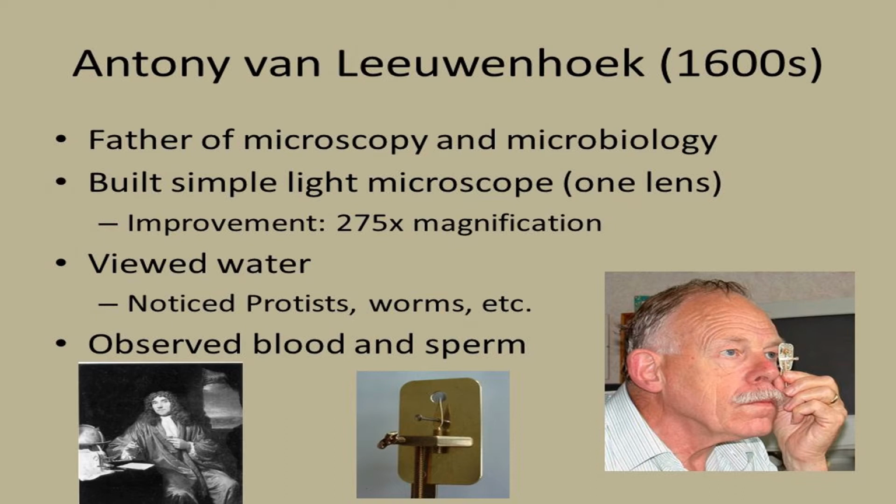He built simple light microscope, meaning one lens only, and using improvement, it can magnify a microorganism 275 times. So ito yung kanyang simple microscope, and using this one, he viewed water and he noticed protists, worms, and others. He also observed blood and sperm.